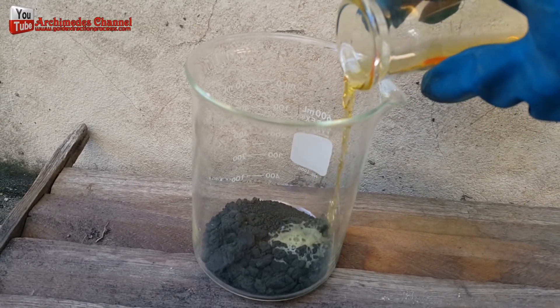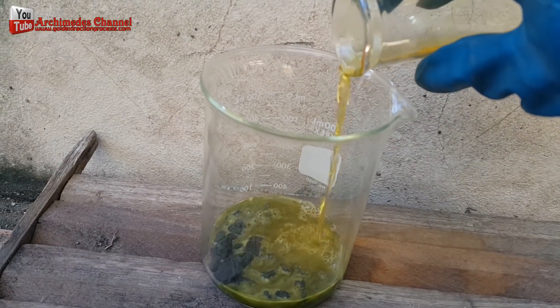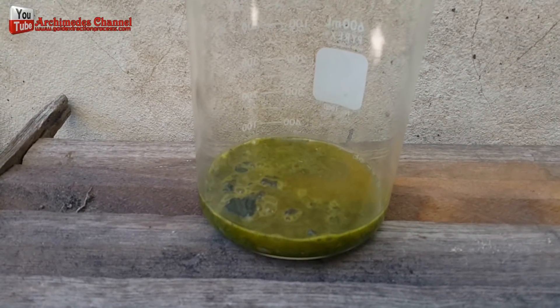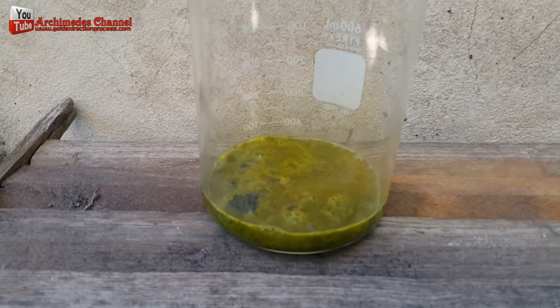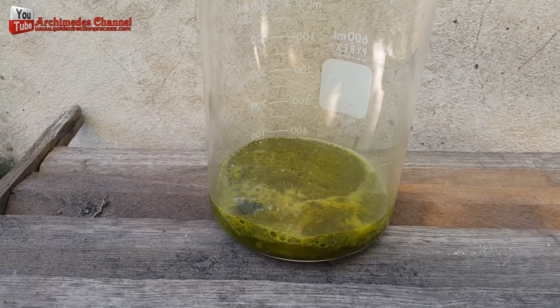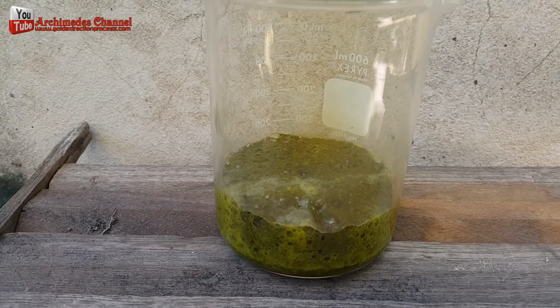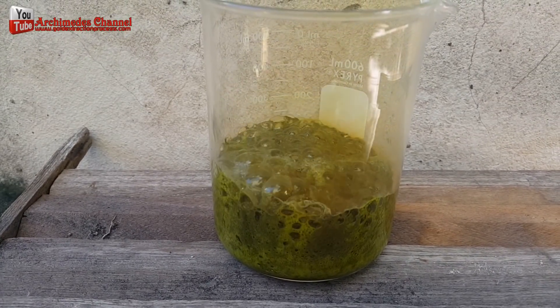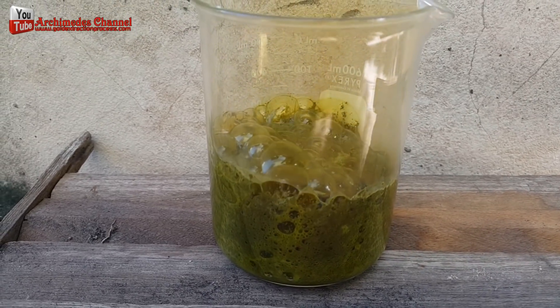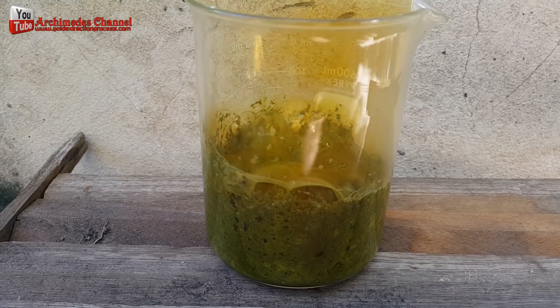I slowly poured the aqua regia onto the gold fragments, being careful to avoid any overflow caused by the chemical reaction.